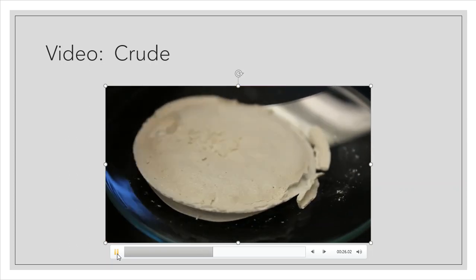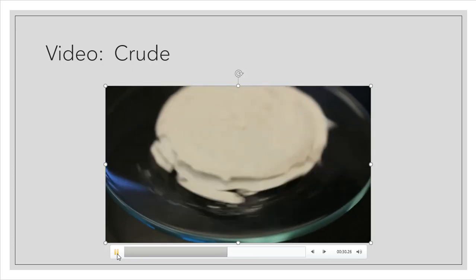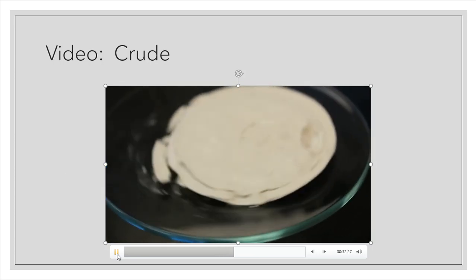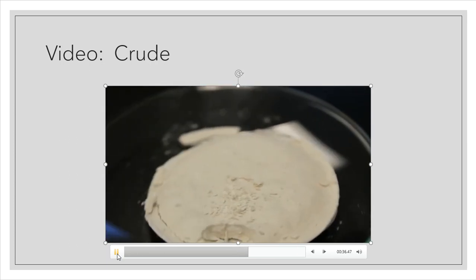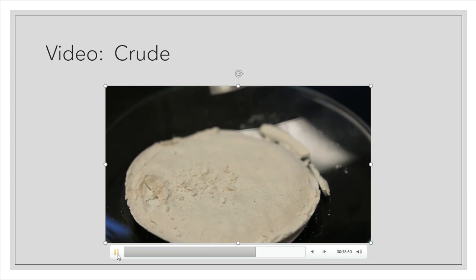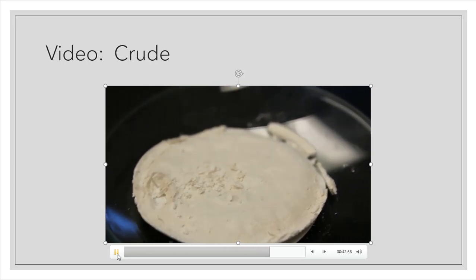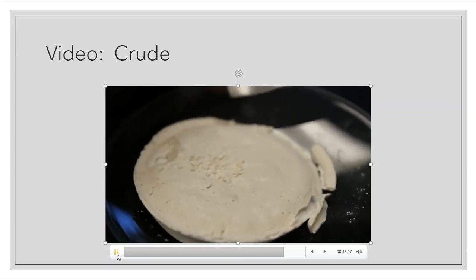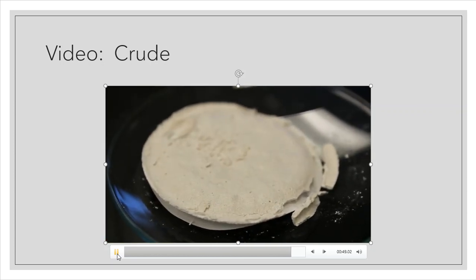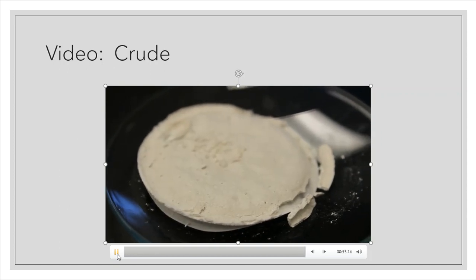You can't really see it in the video, but this is not really a white powder. This is more of a pearlescent powder. It's very shiny, it's very shimmery, and you can't really see that. It just really looks beige in the video. But imagine a pearl, and imagine how that pearl might look like on a piece of jewelry. And that's exactly what this product, the crude product at least, looks like at this point.